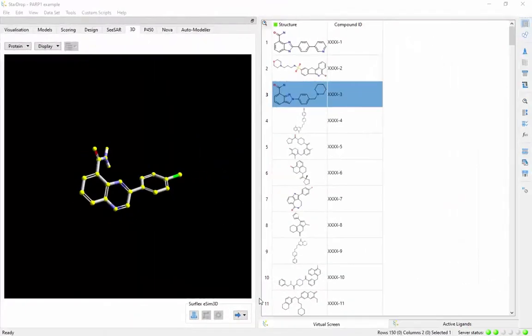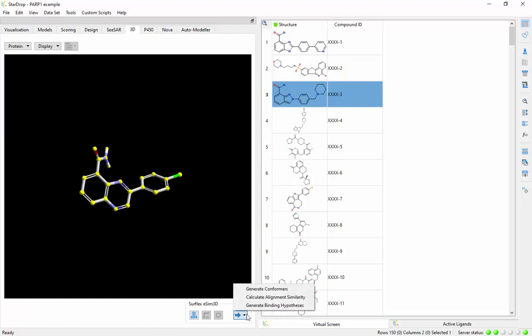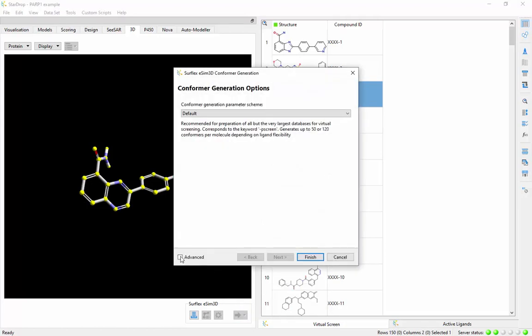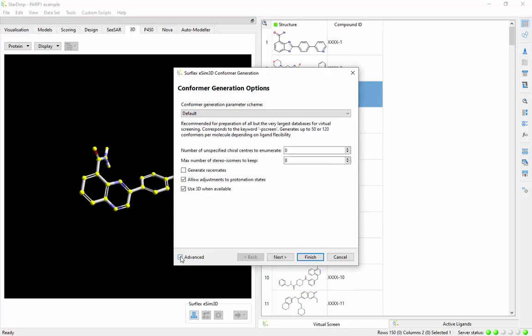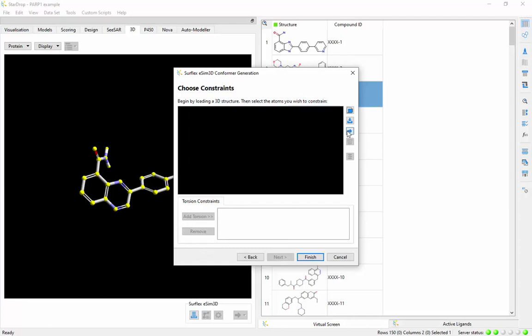Underpinning Surflex eSIM 3D's alignments are ensembles of 3D conformations generated with the ForceGen method that enables you to control conformation and stereochemical sampling, protonation state, and positional and torsional constraints.